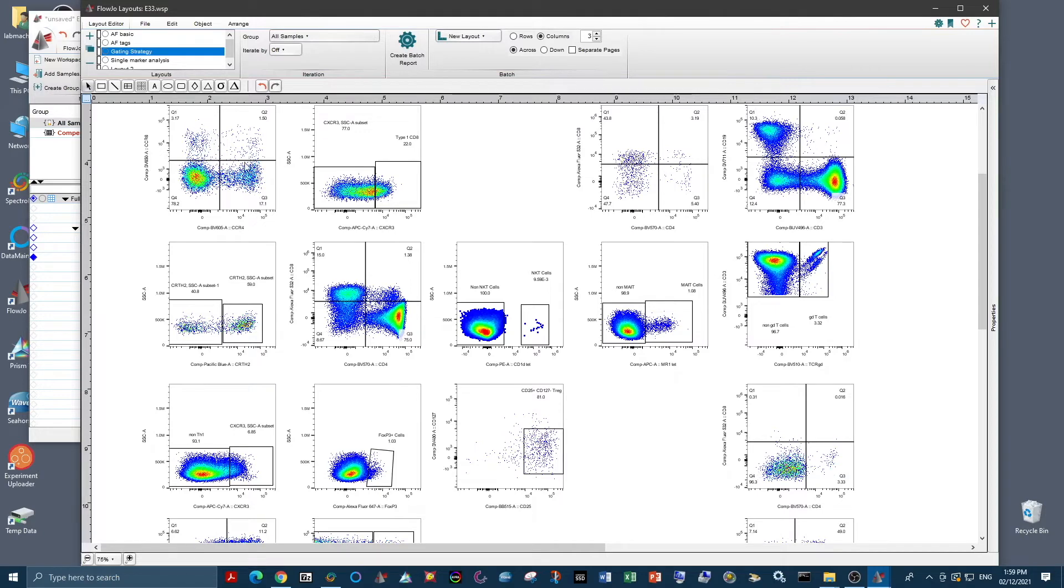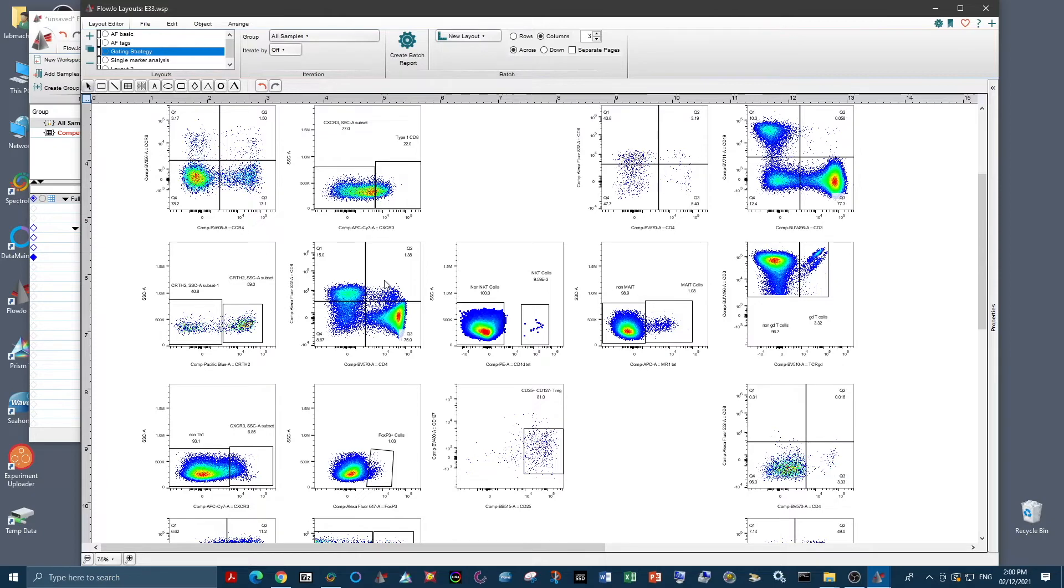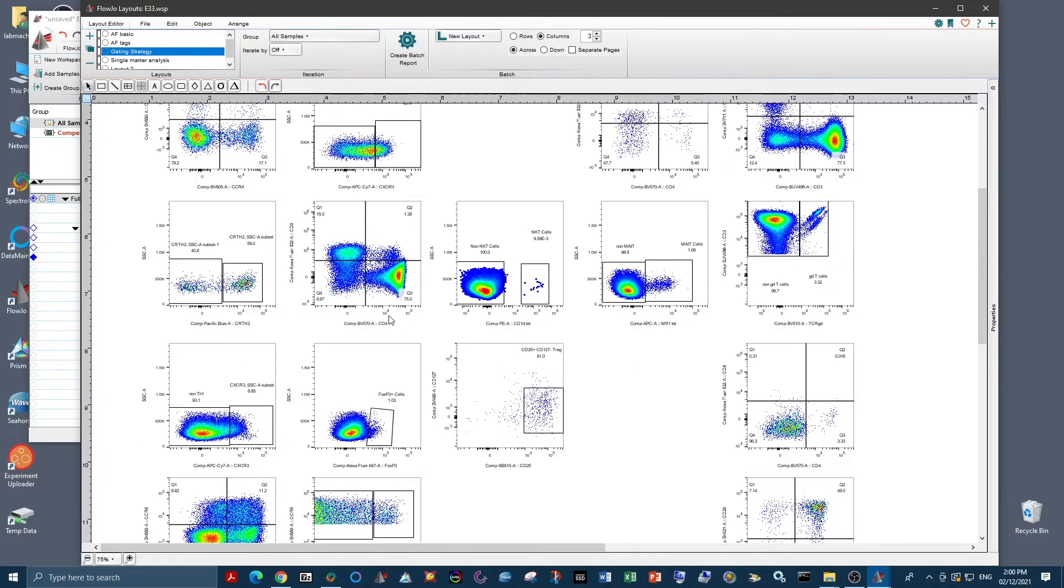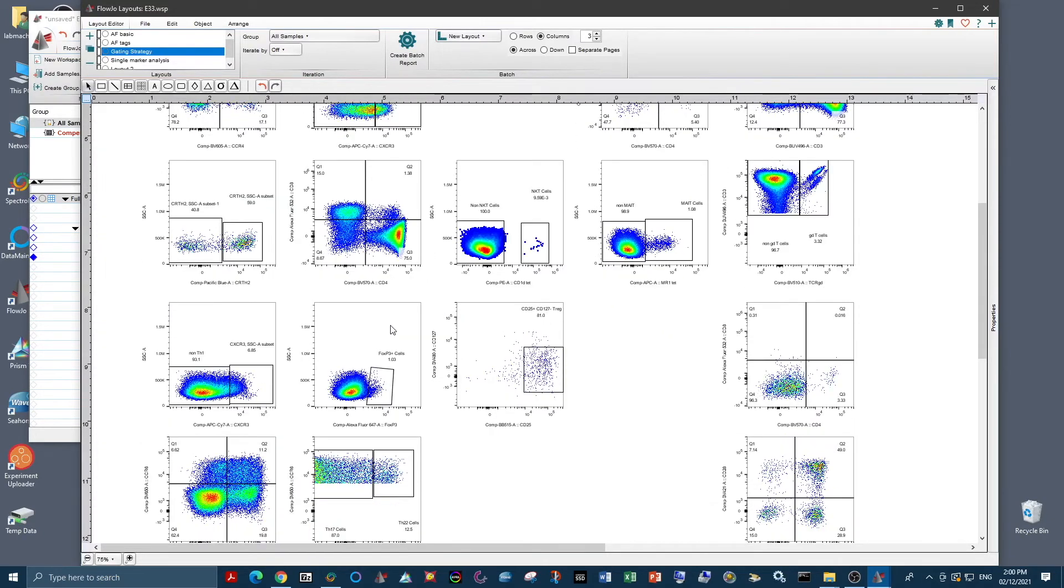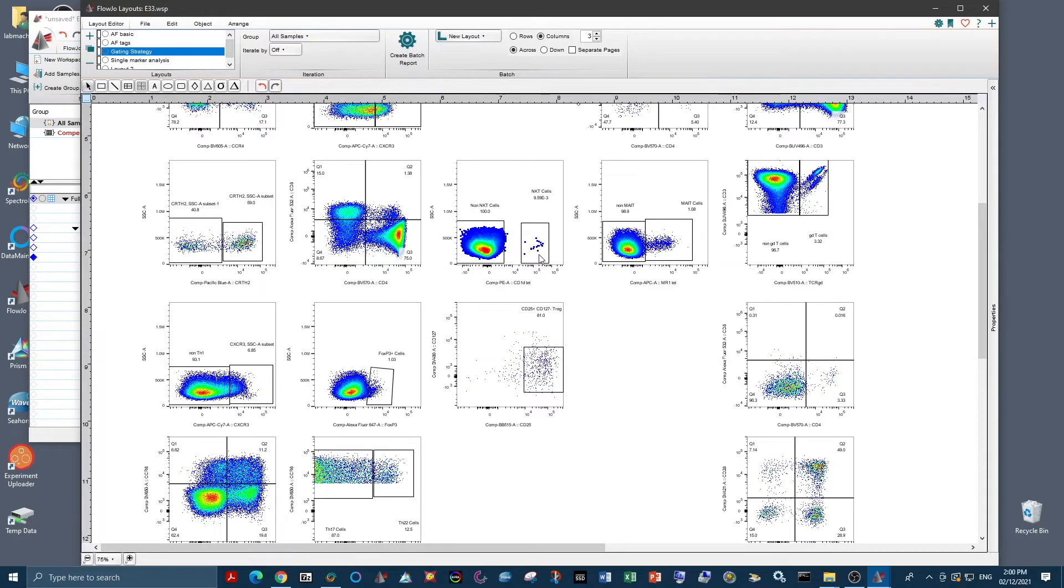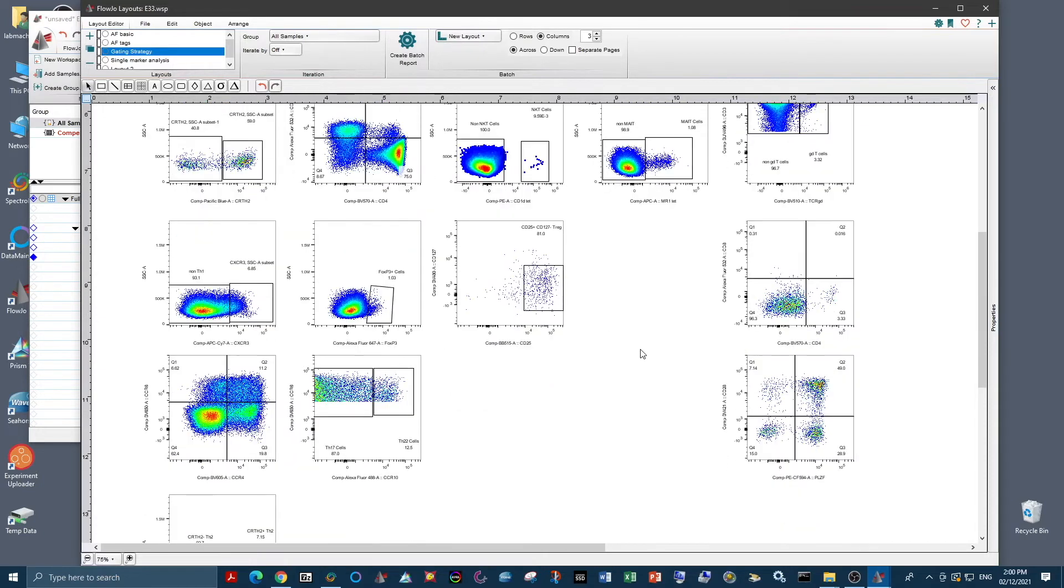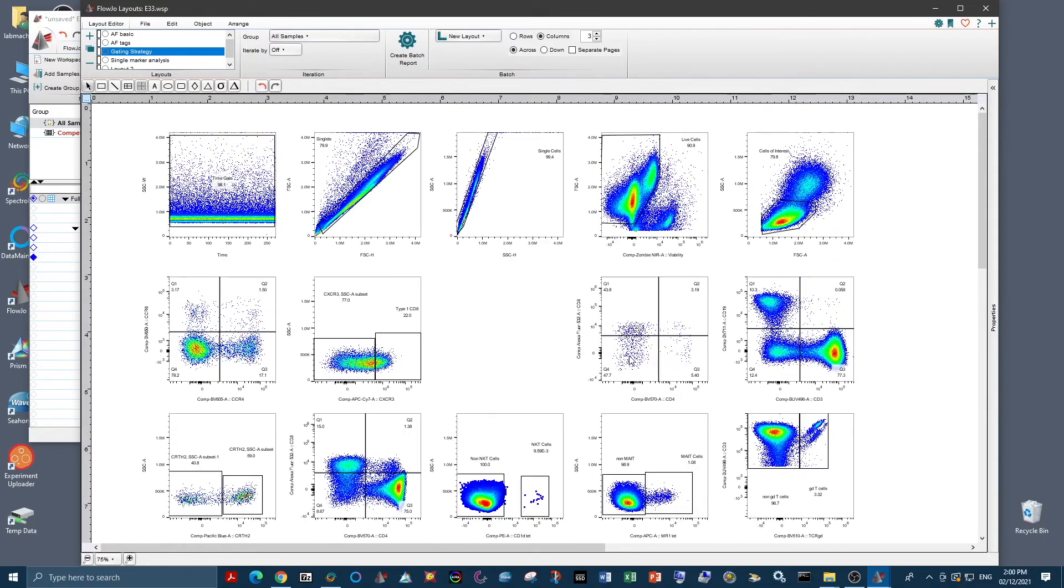And we can also assess any spreading error that we see, such as here where CD4 is spreading into CD8. And we need to just make sure that we can clearly resolve the populations that we're looking for. We also want to make sure we can clearly resolve any readout markers, such as this tetramer here we have on NKT cells. We want to make sure that they are clearly resolved from the negative and that we can use them for the required analysis.